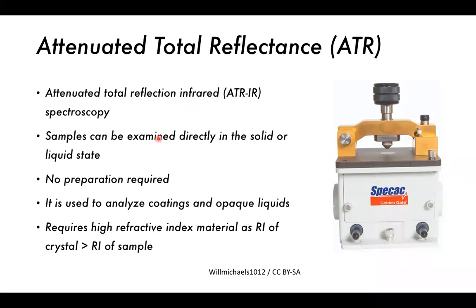And so samples can be examined directly in a solid or liquid state. No preparation is required. We simply place the sample on top. If it's a solid sample, you can use this press to push it against the crystal a little bit. It's not always necessary, but it can give a better fit. If it's a liquid, the liquid will adhere to the crystal pretty easily. No preparation is required. It is used to analyze coatings and opaque liquids. It requires high refractive index material, as the refractive index of the crystal must be greater than the refractive index of the sample. So usually the crystals that we use are going to be diamond.